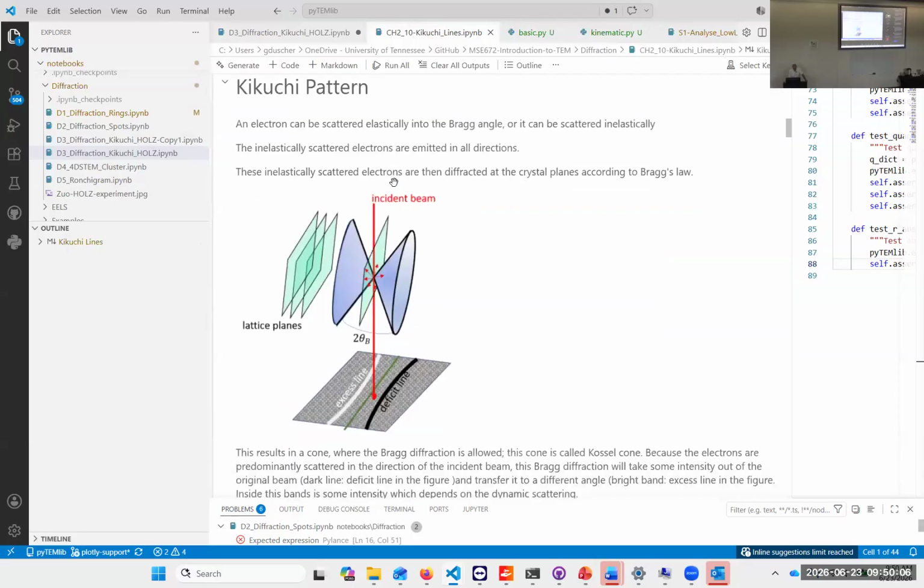some pictures here. Okay. So Kikuchi lines, and that's why we can use them also in SEM as part of the electron backscatter diffraction patterns. They originate in the sample. So what happens is the electron comes in here. It scatters by the phonons in all kinds of directions.